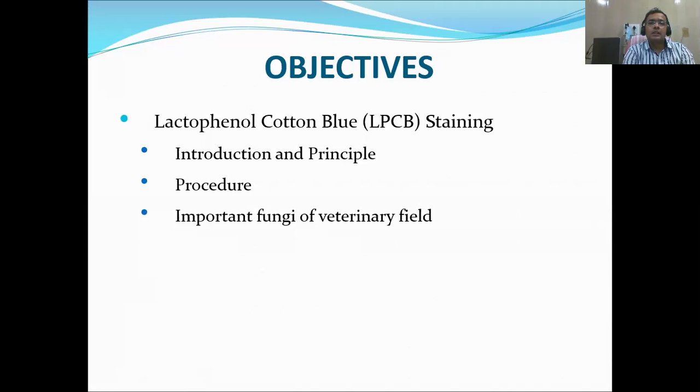So in today's class, we will move in this way. First, I will give you some introduction and we will discuss in brief the principle of this procedure. Then we will go through the procedure. I have also kept one video to illustrate the procedure for lactophenol cotton blue staining. And at the end, we will see the important fungi of the veterinary field.